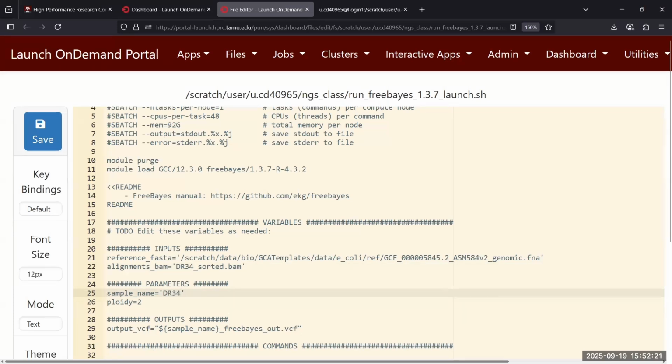Now click on this until the arrow points down. There it is, FreeBayes. Now click here and edit. Okay, now line 22. Just the value. That's the variable, so take the value from the slash out of it. You've got to pass it, probably send line numbers.